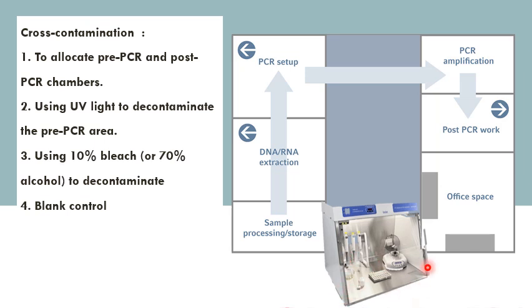bacterial contamination is gone. And you need a blank control to be carried through your assay, so you make sure that there is no contamination. Once you see the blank control is free of bands at the end of the gel electrophoresis, you will confirm that your assay is free of contamination. So you need always to add a blank control to your PCR.